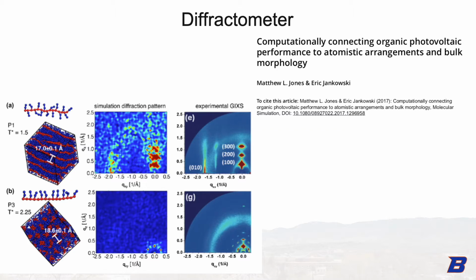For example, in order to make the above figure, the simulation data would have to be opened in a program like VMD and manually rotated and measured to look for these periodic features that most likely correspond to these bright diffraction peaks. And this reliance on manual rotating and measuring and looking for these features does not lend itself to a true simulation workflow.